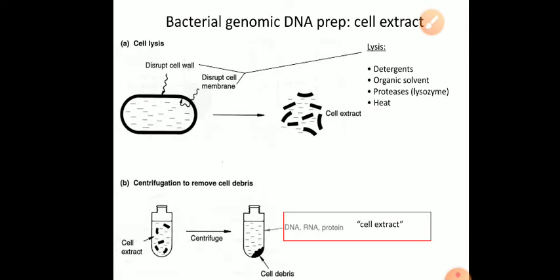Microbial cells, because of the action of gravity and centrifugal force, settle down at the bottom of the tube and form a button, which is called a cell pellet or microbial pellet. Now the supernatant is the liquid medium, throw it, decant it. Now at the bottom of the tube you have microbial cells separated.